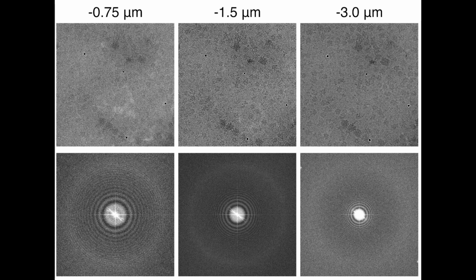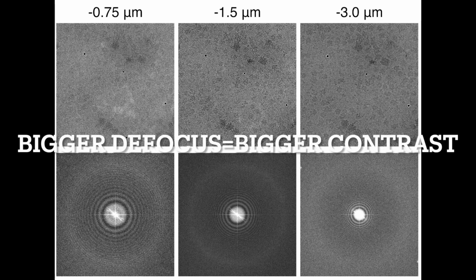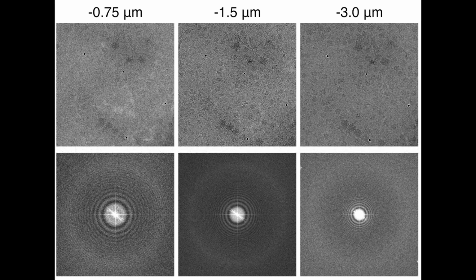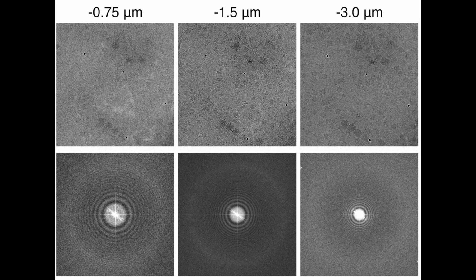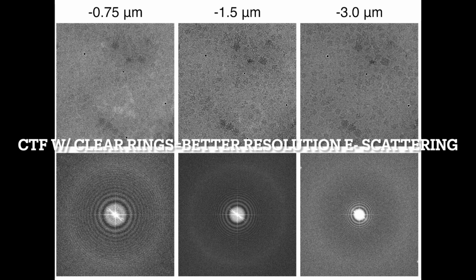So as we're seeing in this image here, there's some amount of defocus applied, meaning that when you're actually taking the sample, let's say the focal point is down here, you might have the sample slightly above or below, so you're slightly not at the focal point, to give you a little more contrast so you can actually see some of the structures that are in the sample there.